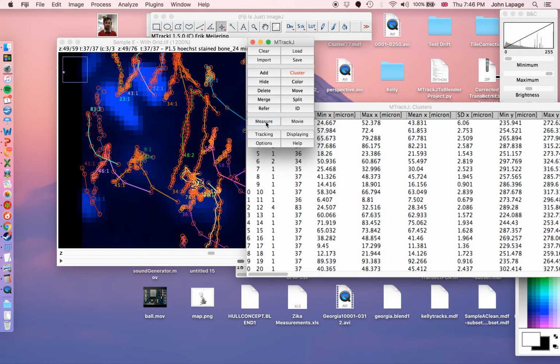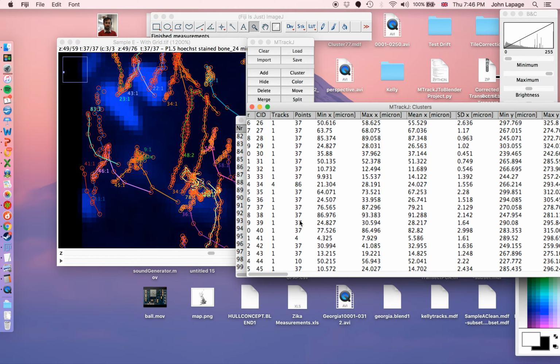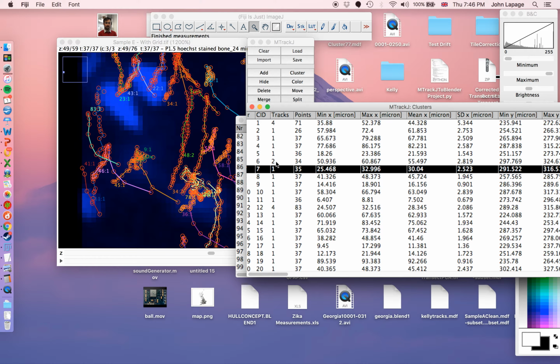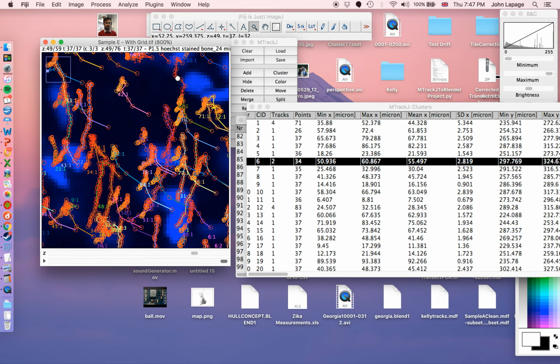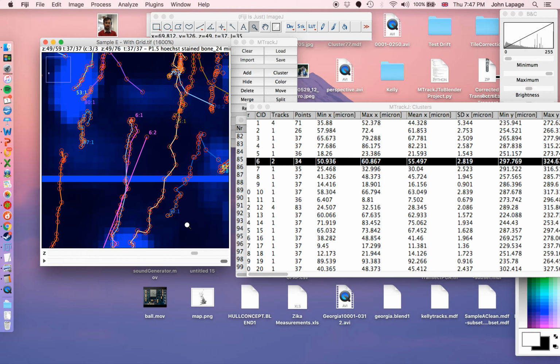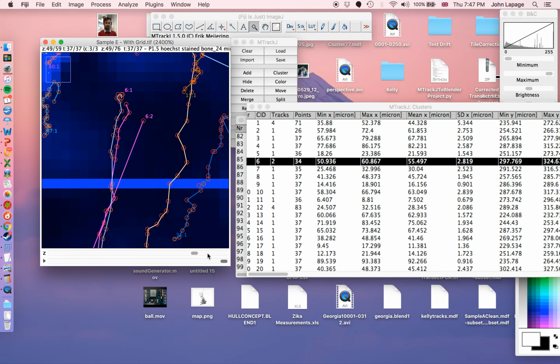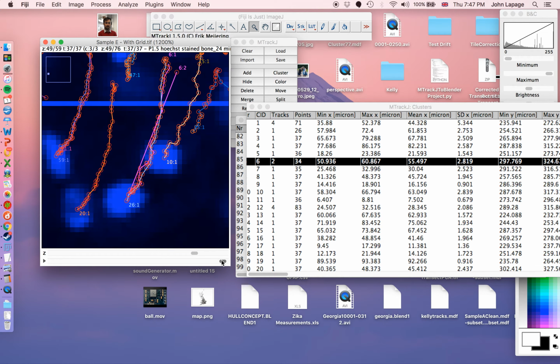And if I click measure again, just so we're not accidentally going back on ourselves. 1, 4, 4, 4, 4, cluster 6. And cluster 6 is the last one, between 50 and 60, so somewhere in this range, and then 297 and 324. Here we go, 6.1 and 6.2. So 6.2 is just a random point, it looks like it's an error, so we'll delete that one.